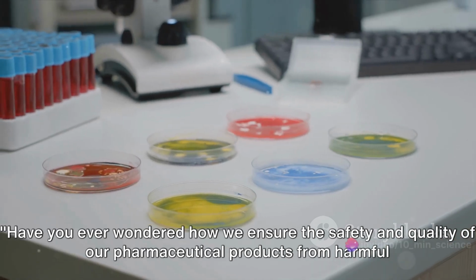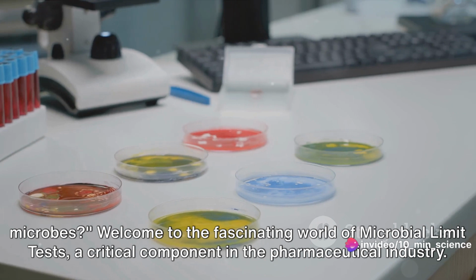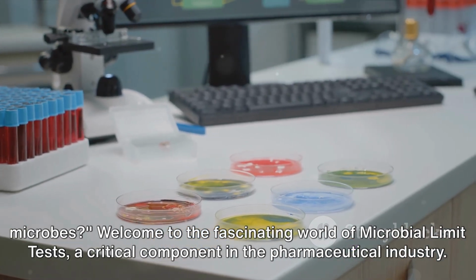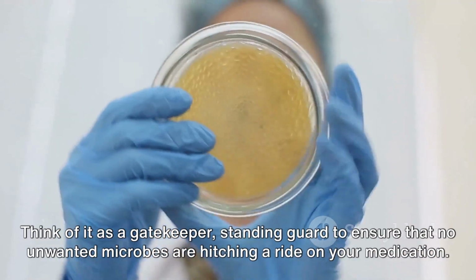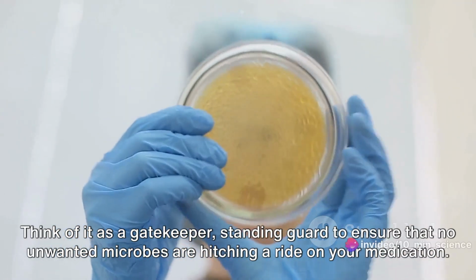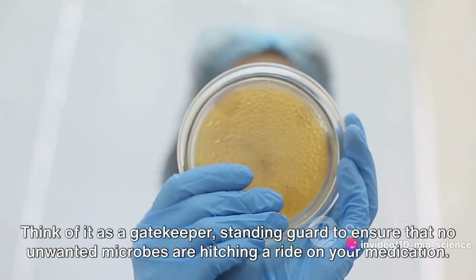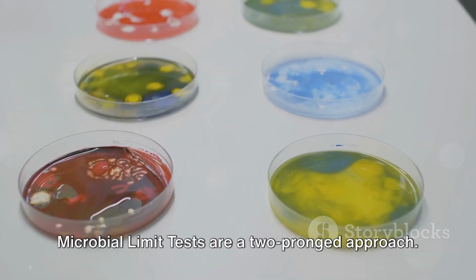Have you ever wondered how we ensure the safety and quality of our pharmaceutical products from harmful microbes? Welcome to the fascinating world of microbial limit tests, a critical component in the pharmaceutical industry. Think of it as a gatekeeper, standing guard to ensure that no unwanted microbes are hitching a ride on your medication. Microbial limit tests are a two-pronged approach.